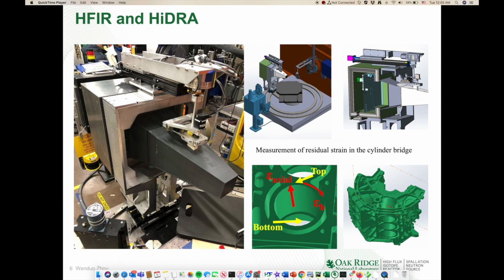It has a two-dimensional detector, which is configurable to 2048 by 2048 pixels on a moving detector arm, while usually it is configured to 1024 by 1024 pixels to match the instrument resolution.